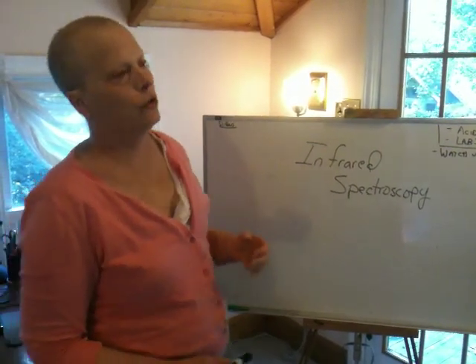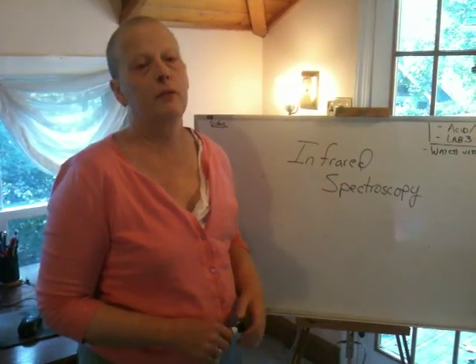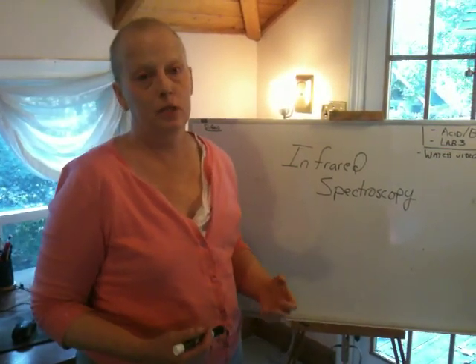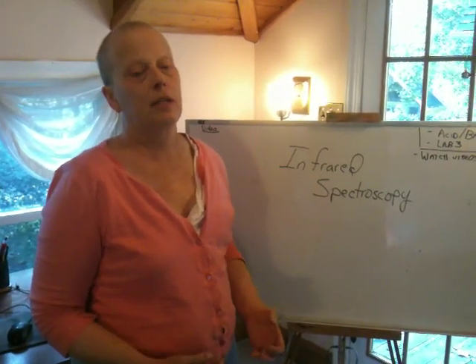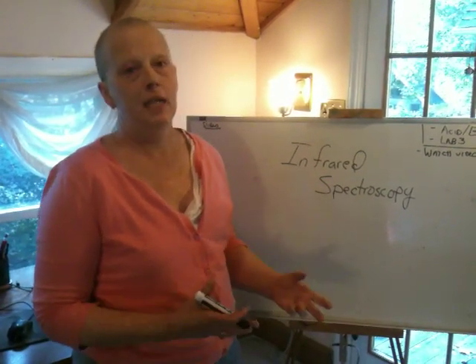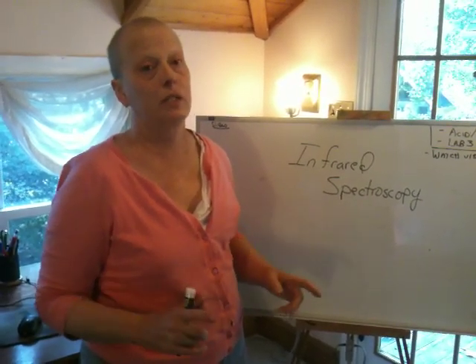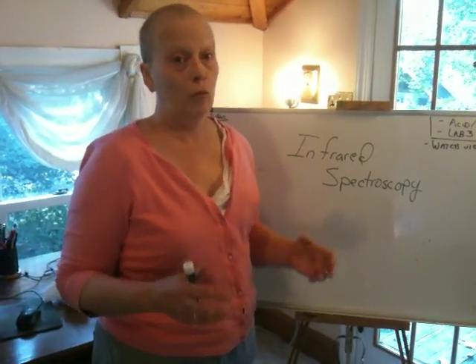this week. So you should be finishing the balance of Lab 3, and I did send you some information on this using Moodle. I gave you some guidance on all the questions. Realize that this lab, this week, which is Lab 5, is related to Lab 3 in that you're going to get an unknown sample that has some combination of an ionic, acid, base, and neutral compound. Okay? And one thing I want to really focus on, and I wrote you this in the Moodle email, you're only going to have 3 of those 4.